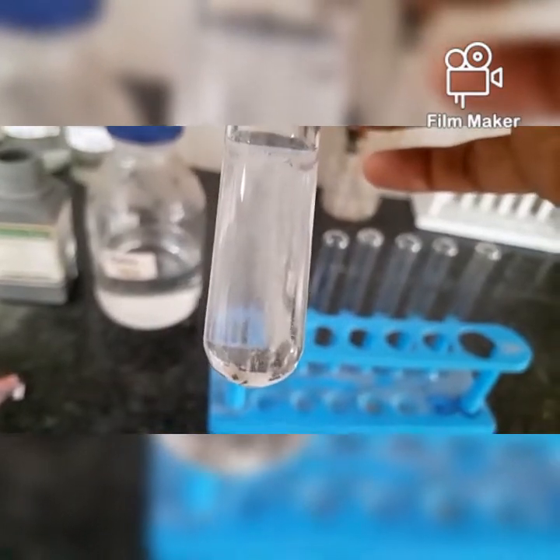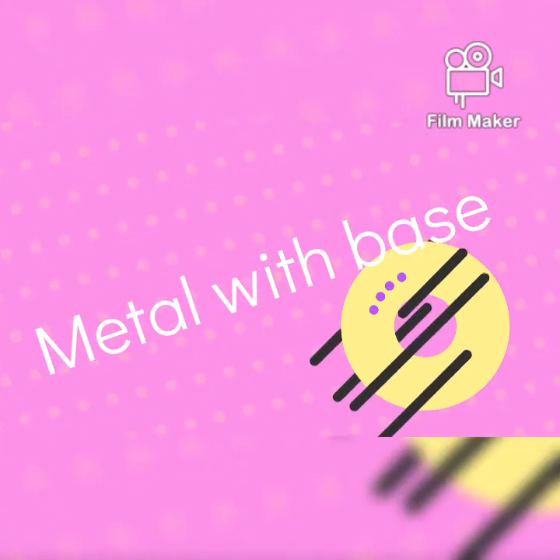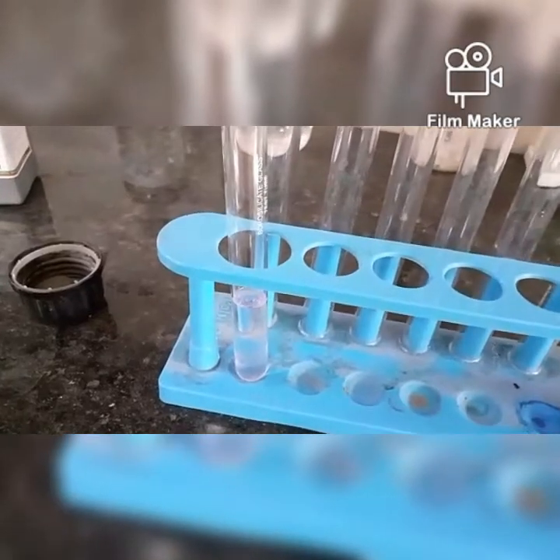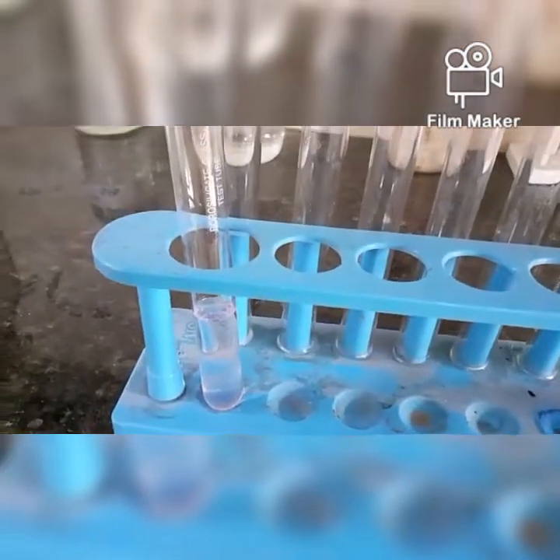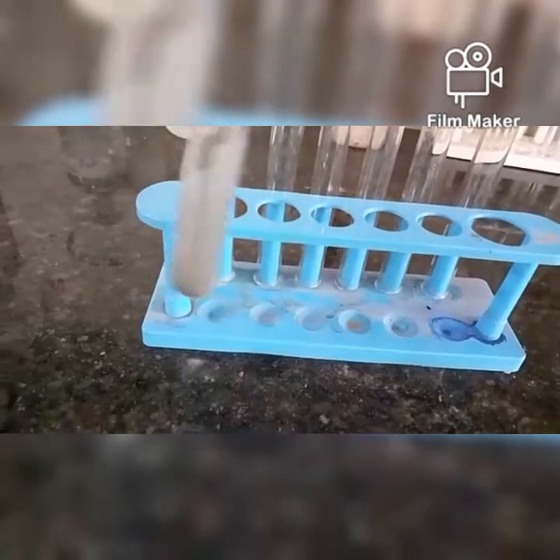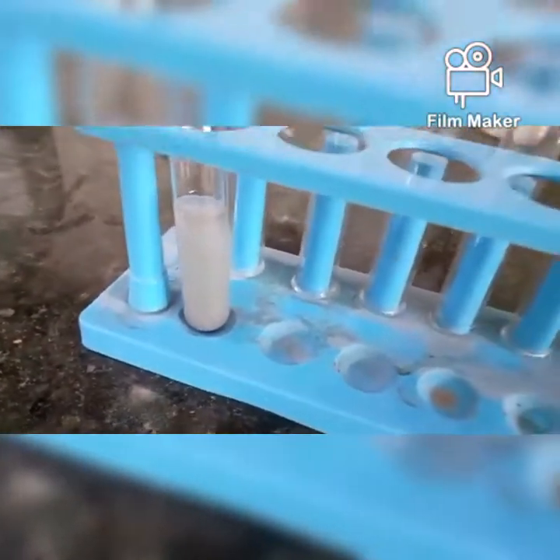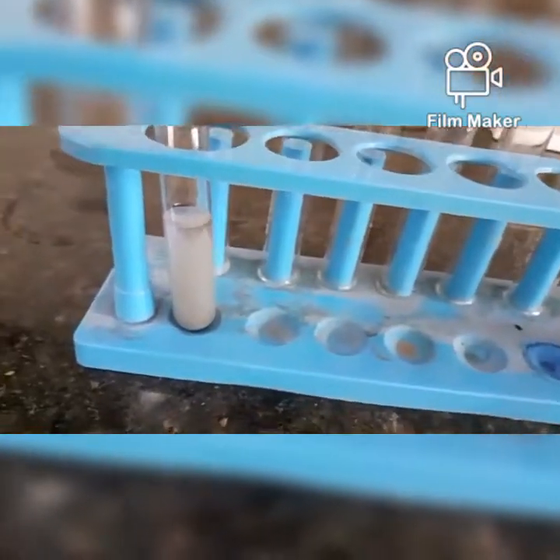Now let's check what happens when the metal reacts with bases. I have taken NaOH in this test tube and now I'm going to add the zinc dust to it and let's see what's going to happen. Nothing really seemed to be taking place. In case of sodium hydroxide, there is another compound that is formed. Otherwise, usually the metals don't react with the bases, right?